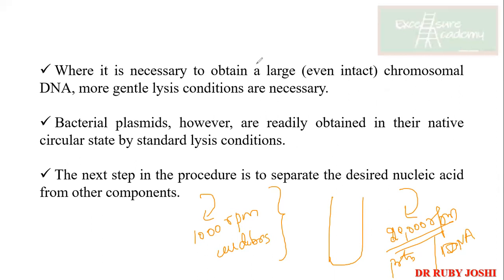Yes, anyone? Ma'am, protein will be in the bottommost part of the centrifuge tube. Akshay, your voice is breaking. I just heard protein and bottom. So you have got the supernatant, you have got the bottom. Where is DNA going to lie? DNA will be in the supernatant, whereas the protein will always be present in the pellet region. Okay, Akshay, you have just said the opposite.